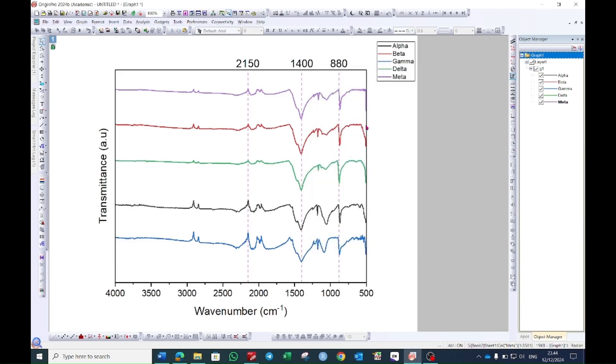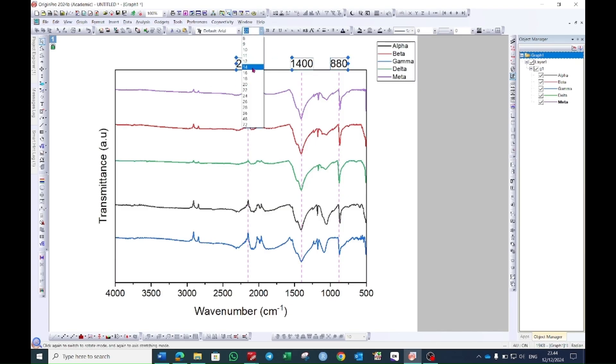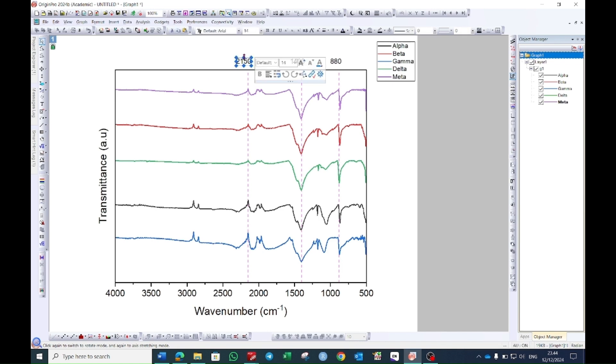So in this way you can demonstrate the lines. Suppose you want to make them small. For example, you can give them the size of 14 and then drag it back to the peak line.